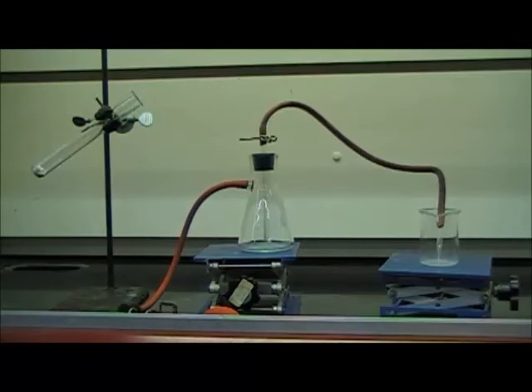This is the setup in which we're going to try to determine what the value of the gas constant R is. And to do so, we have to determine experimentally what the pressure, temperature, and volume of some, and the number of moles of some sample of gas is. This looks like a fairly complicated setup, and it's a little bit complicated, so let me show you what we're going to do.